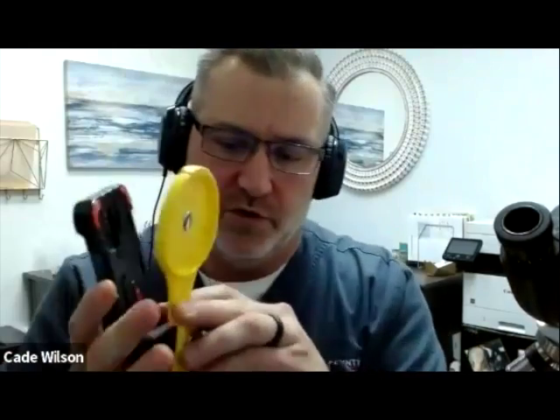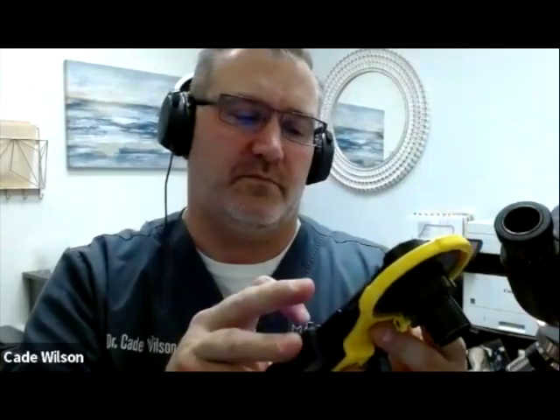I'm just going to pop this all apart real quick. What you would do is just put the phone case, this is going to be a case on a case, but that's okay. You just line up the camera. In this case it's my top camera. So I get the phone all set up here. We call this a lollipop, that's kind of what it looks like. And then everybody's phone could go on here. Just get this back set up.